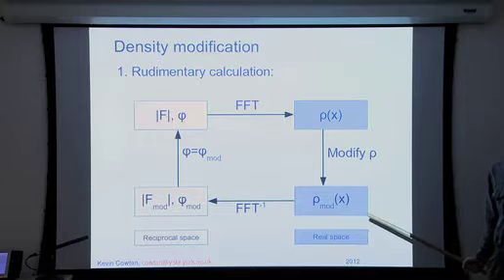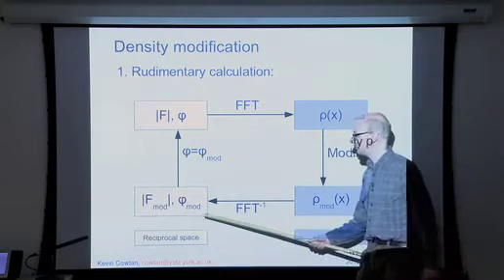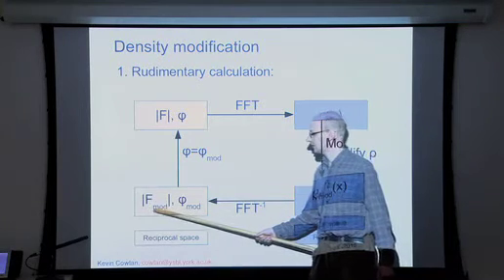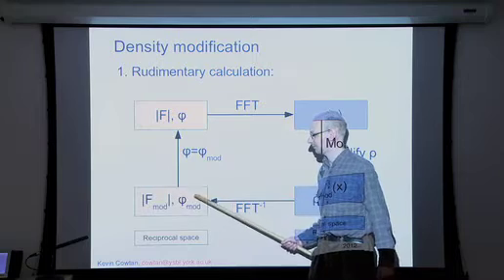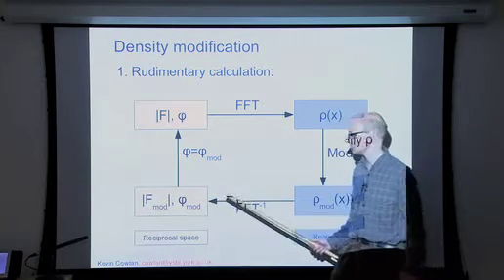It's going to be noisy, and we'll try and reduce the noise a bit using basic image processing algorithms. And then we will calculate an inverse Fourier transform. That gives us a new set of structure factors, amplitudes and phases. Both the amplitude and the phase will have changed.